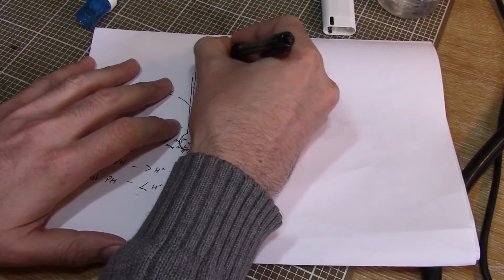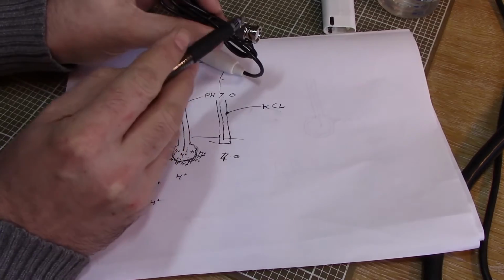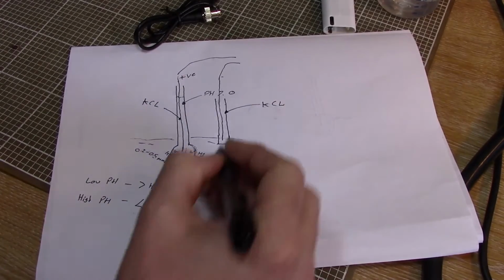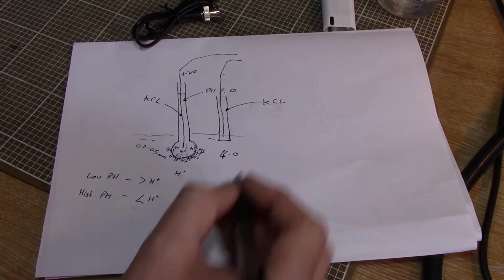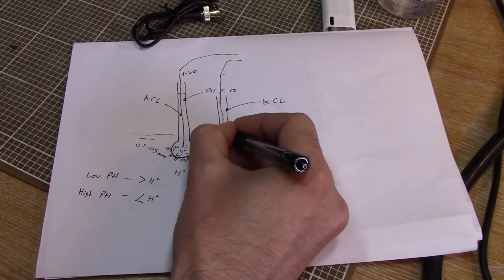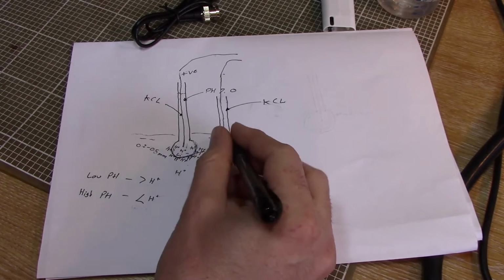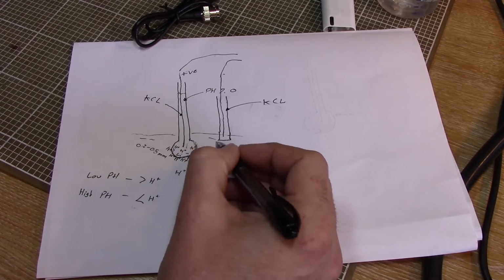So these two wires come up to the BNC plug on the end of our probe, connects direct to those two. So we've nearly got an electrical circuit there, but obviously this is just a straight glass tube and glass doesn't conduct electricity. So we need some way here for this wire to effectively be in electrical contact with this solution. But we don't want the electrochemistry happening. We don't want to just stick a piece of wire straight in this solution.